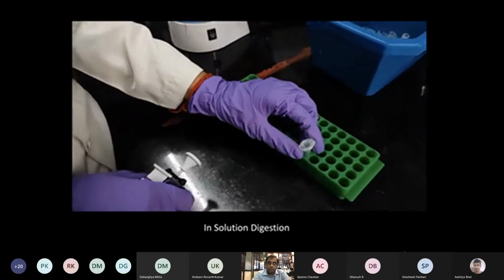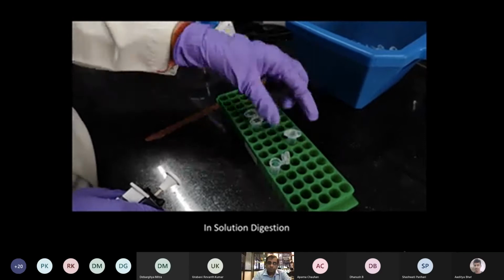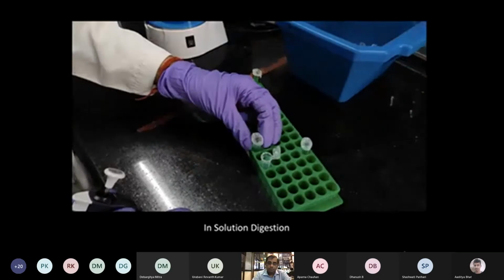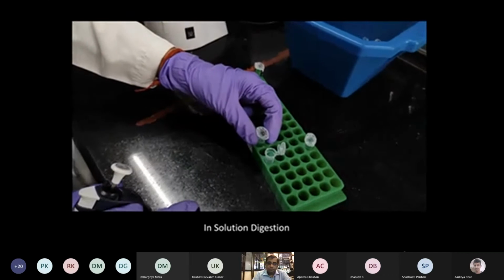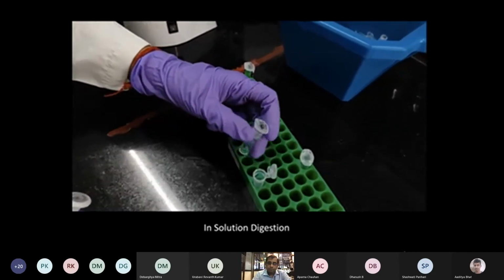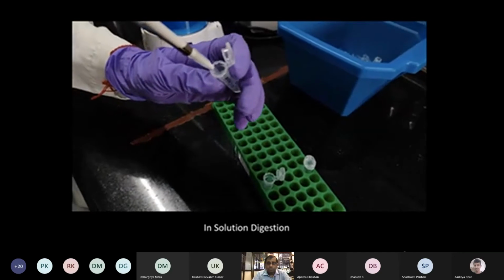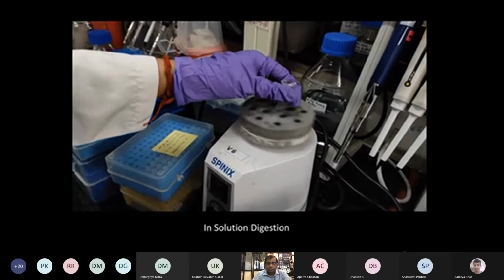So now, after quantification, a suitable volume of the sample is taken for digestion. Before doing the actual trypsin digestion, we need to go through two steps, that is reduction and alkylation of proteins. For reduction, here we are using TCEP, that is tris(2-carboxyethyl)phosphine. An appropriate volume of TCEP is added. The sample is properly vortexed and spun.